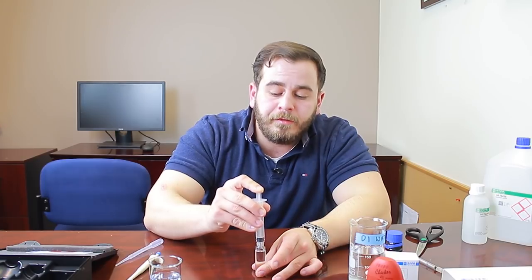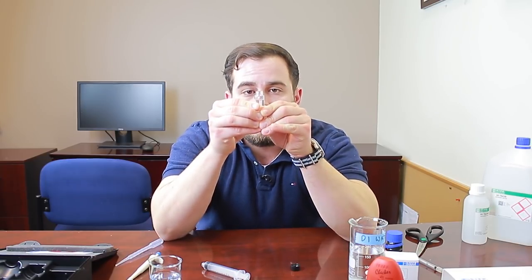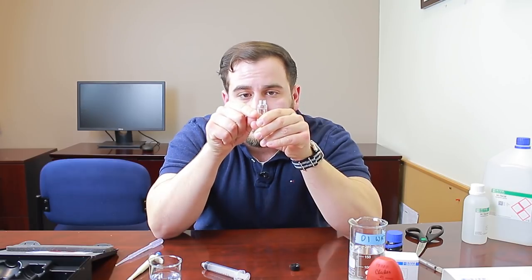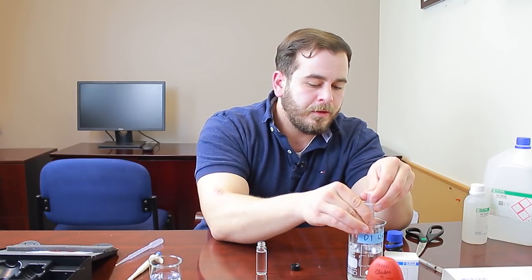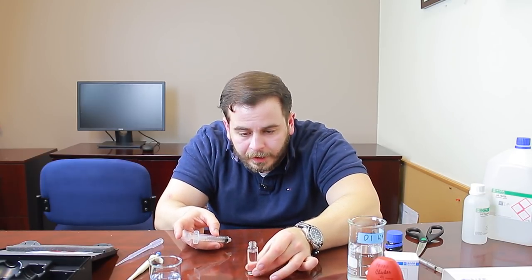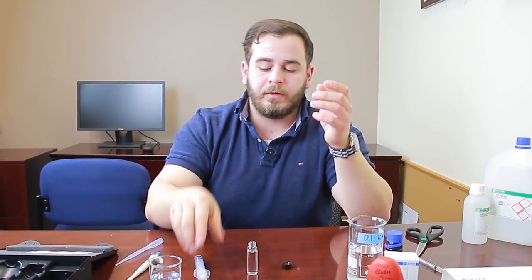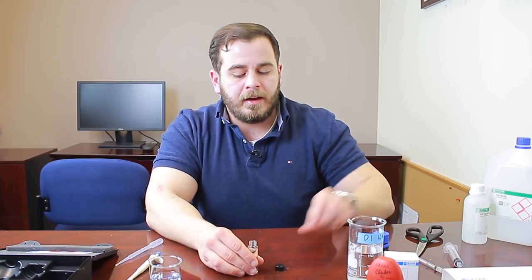When filling to the line, you want to read what's called a meniscus — in this case a concave meniscus. The meniscus is a curve that naturally occurs from surface tension when filling glassware, forming a little U-shape. You want the bottom of that U to reach the line. Make sure you're reading it at eye level so the curve isn't skewed and you're getting an accurate measurement.